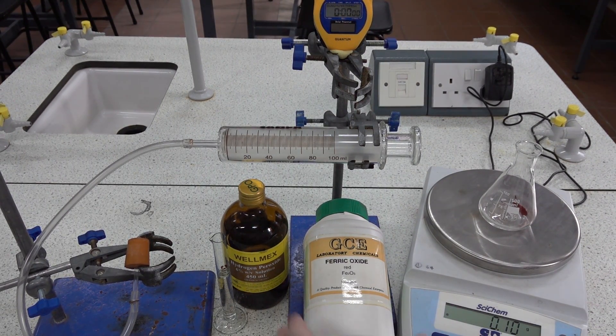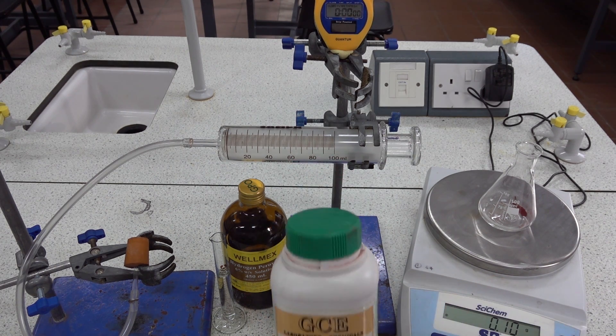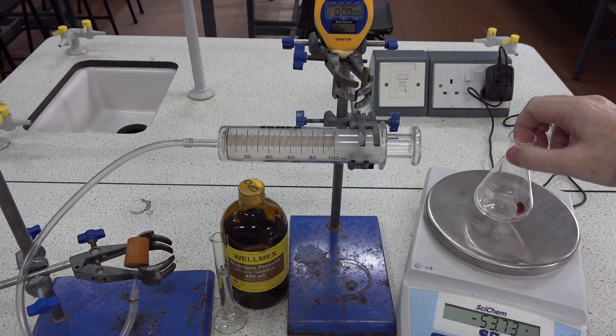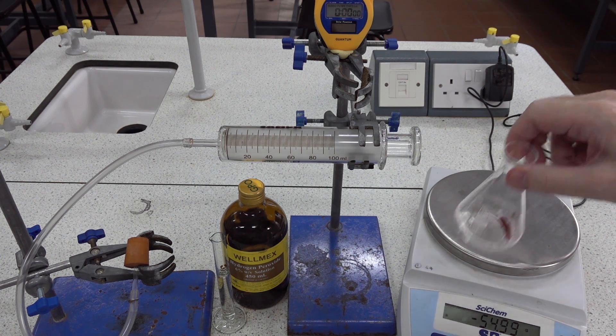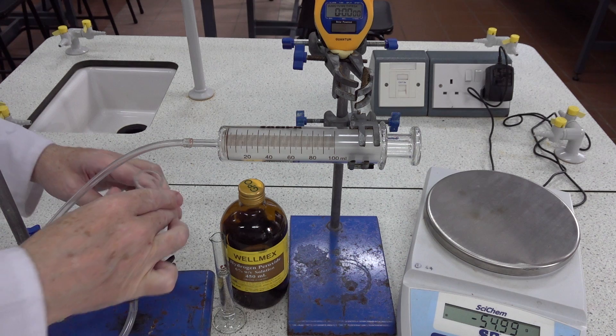Catalysts for the decomposition of hydrogen peroxide. This time we're using Fe₂O₃, iron(III) oxide. We pre-weighed 0.1 grams in the conical flask and clamped the flask.